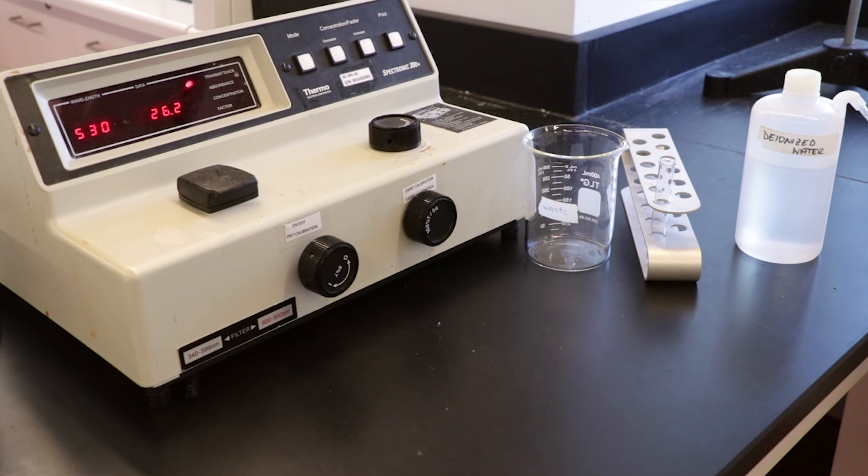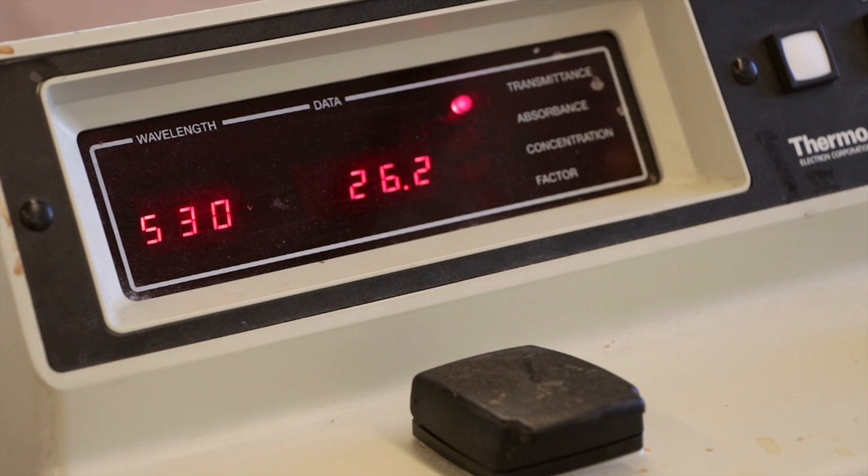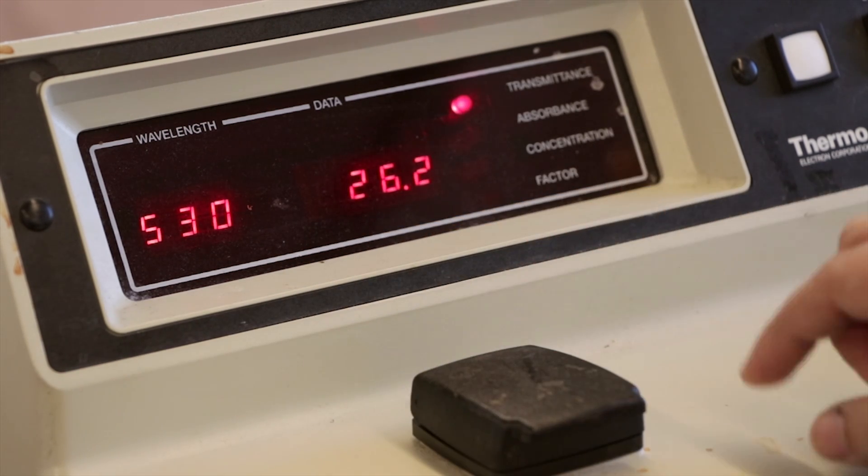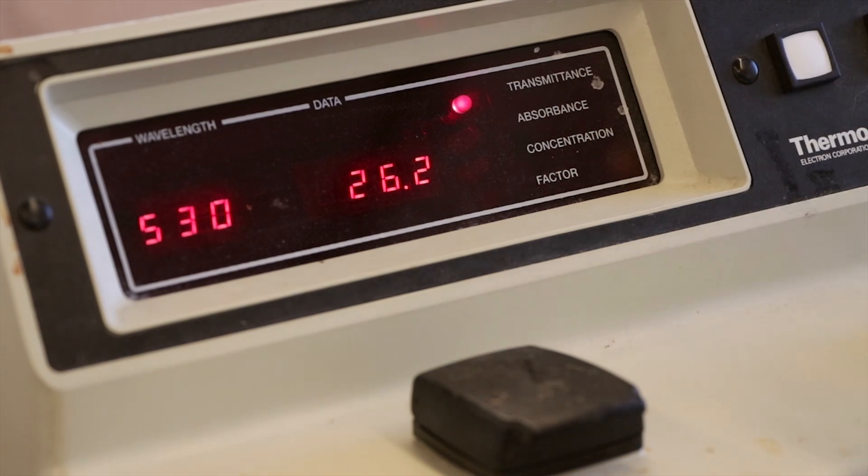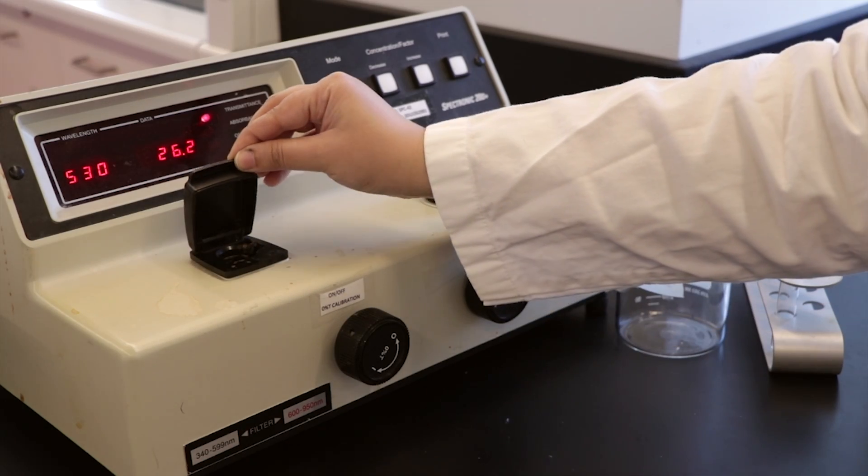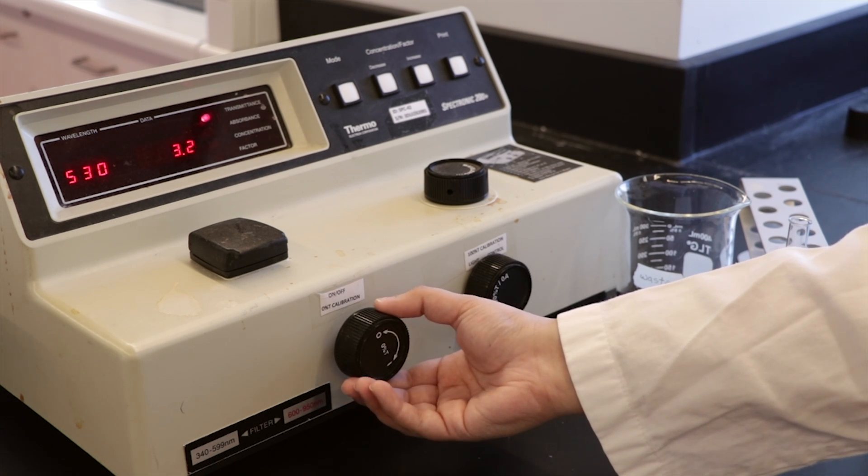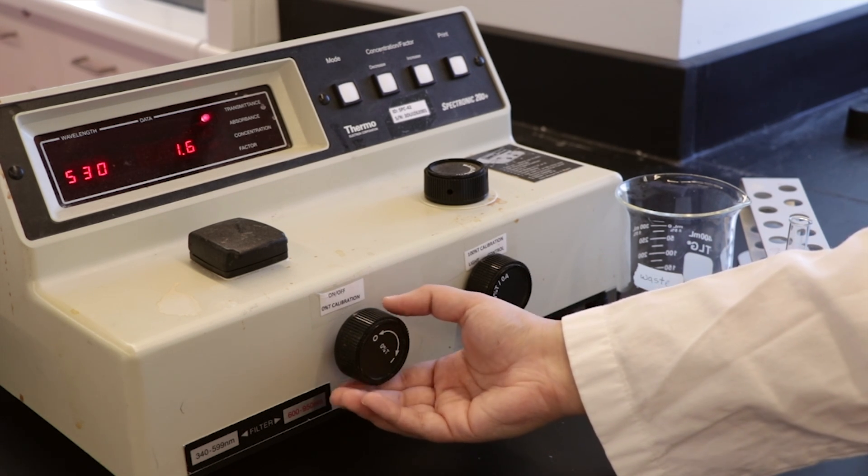Before using the spec 20, ensure that it is on for at least 20 minutes to allow the machine to warm up. Check that the wavelength is set to 530 nanometers and the mode is set to percent transmittance. First, use the left dial to set 0% transmittance. This should be done without any cuvette in the cuvette holder and the lid closed.